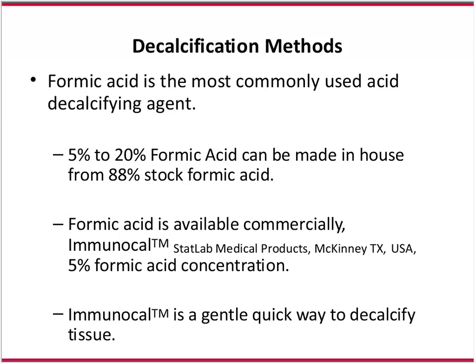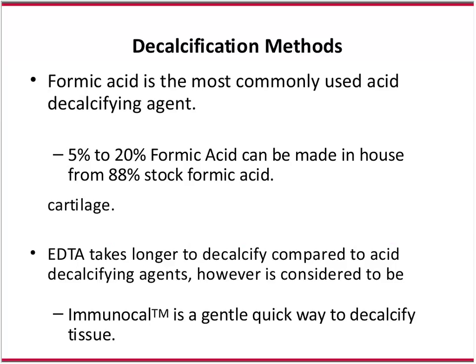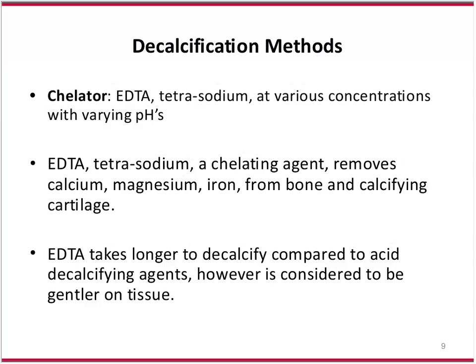It's a 5% formic acid concentration. Immunocal is very gentle, but it's also quick to decalcify your tissue, and it's a great low percentage concentration to use.